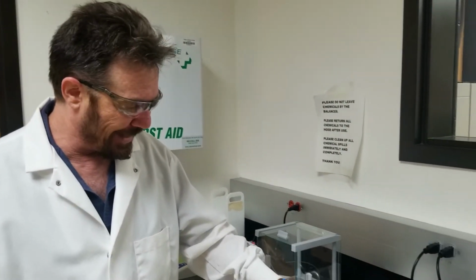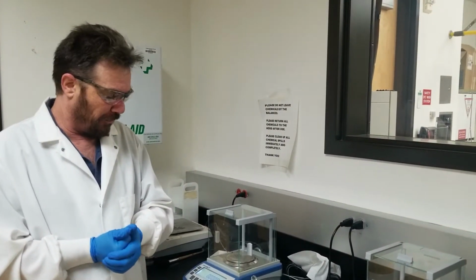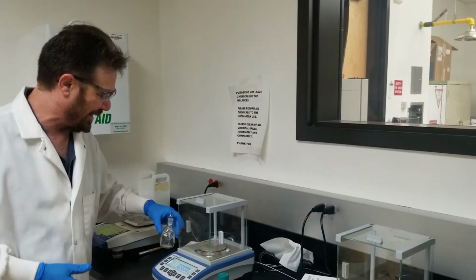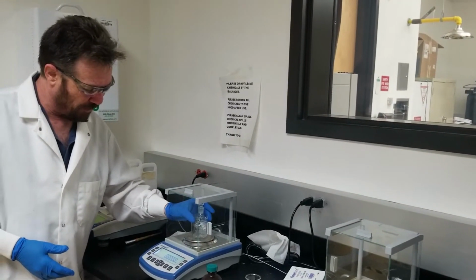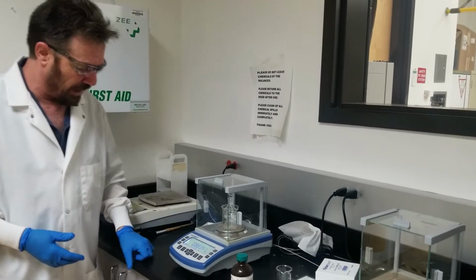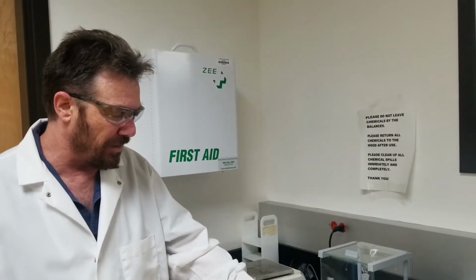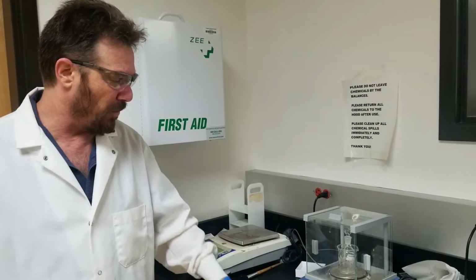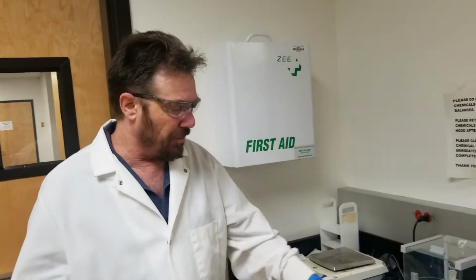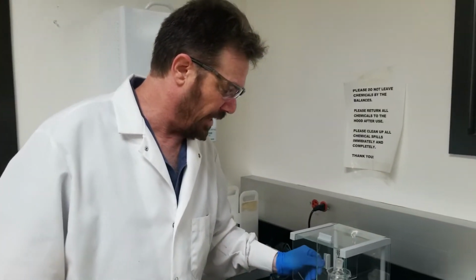Yes. And we don't have to overly complicate this. If we think about what that is in terms of density, let's just take 0.8 as the density. And so that would mean to get 10 milliliters, it would be 8 grams I want to add to that, so that should be around 16. We'll go a little bit more, so 16 plus 8. As an estimation, we should try and shoot for about 22 or something like that on the weight.